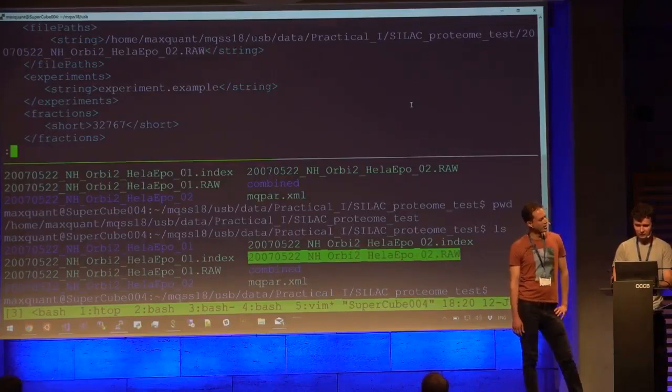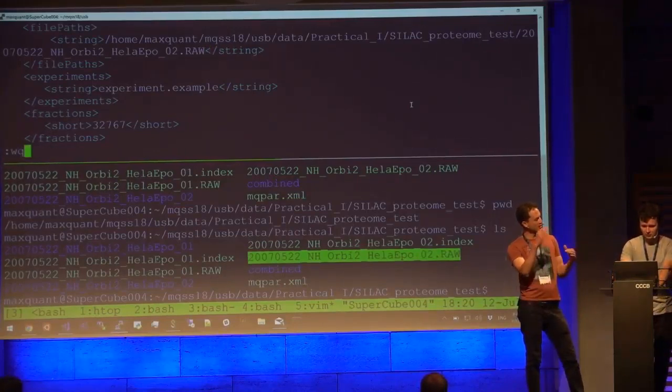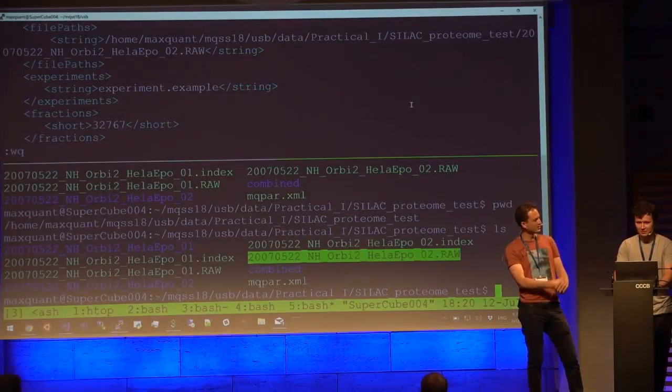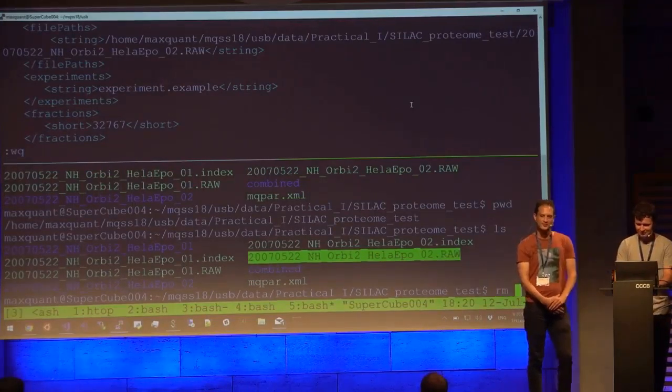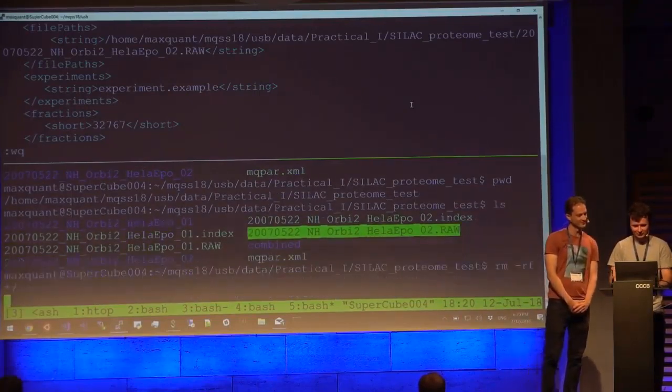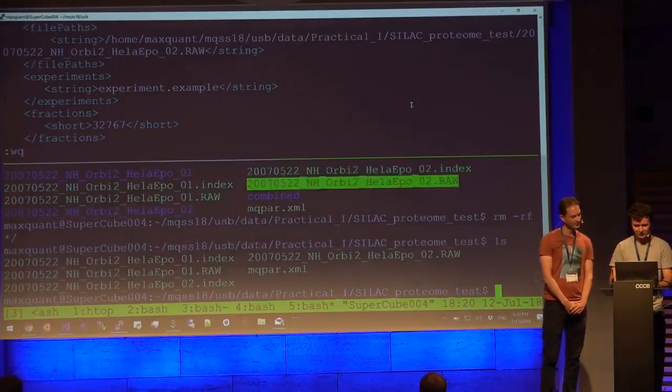So you're in some way redoing exactly the steps that you do in the GUI, just now you're manually entering all the information. Yeah. Another way to say I'm doing the same thing, just in a nerdy way. So I like it. But actually, it's really cool. I mean, this is a really dangerous command, but sometimes important to do.